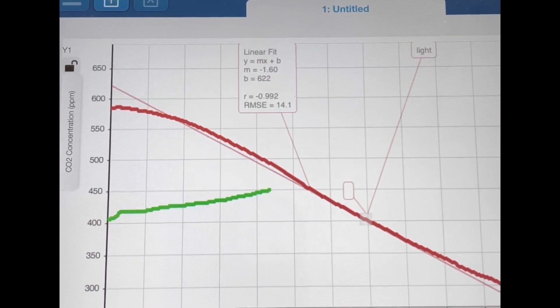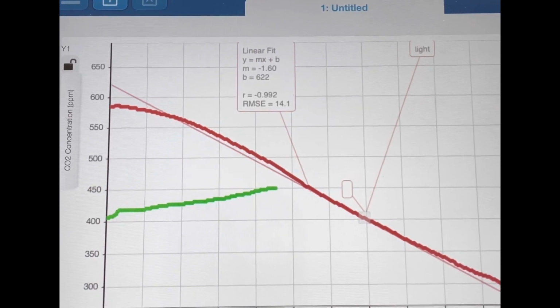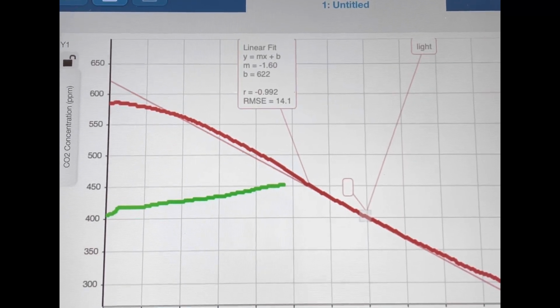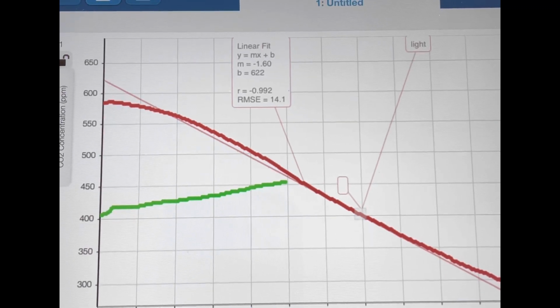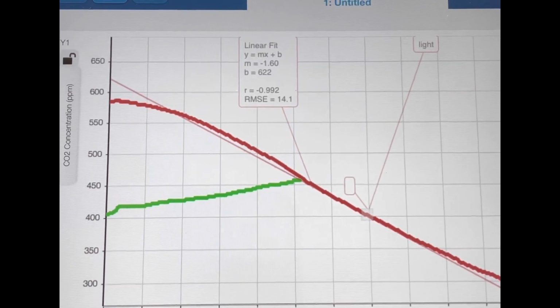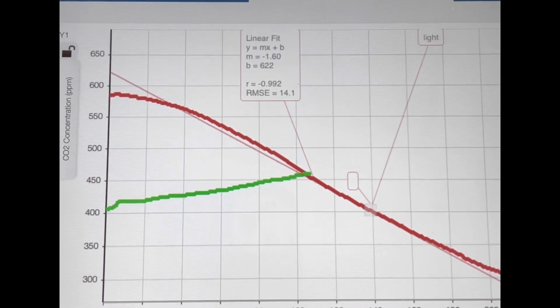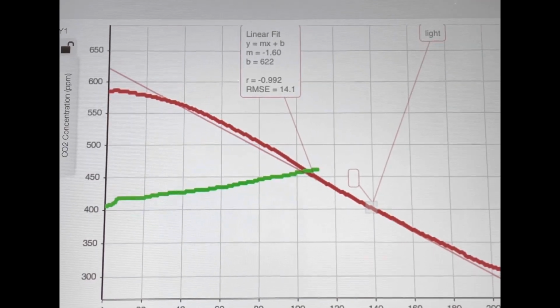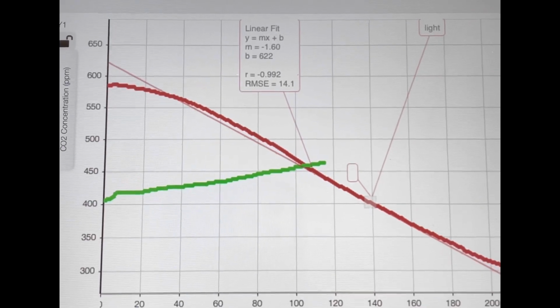Again, that slope analysis is the rise over run, the change in y over the change in x. Notice the first run we had a negative slope. Analyzing rates of change is essential in science: chemistry, physics, biology.